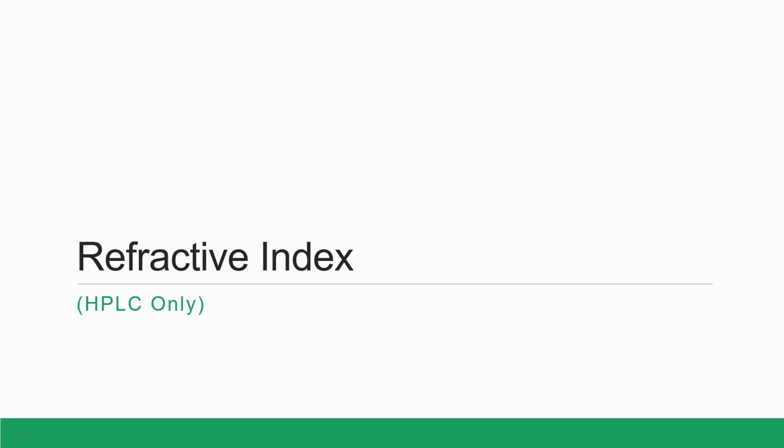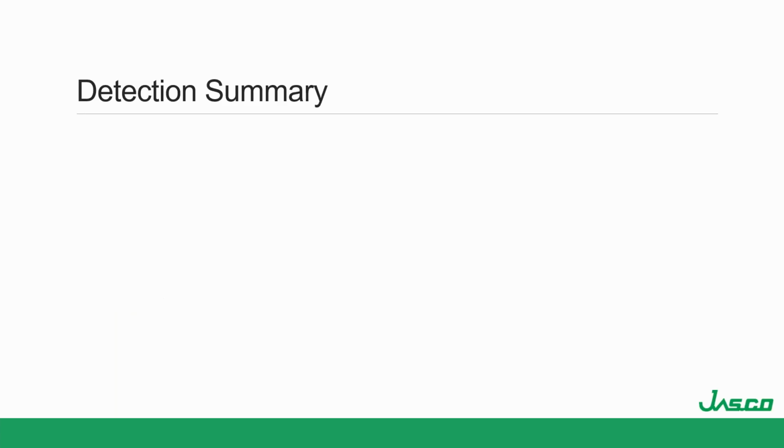All right, so on to refractive index. Now this detector is HPLC only, so there does not exist a high pressure flow cell for this detector. But that's not the only reason we can't use it with SFC.